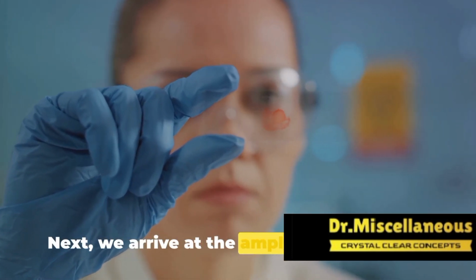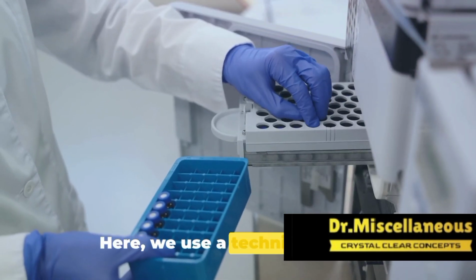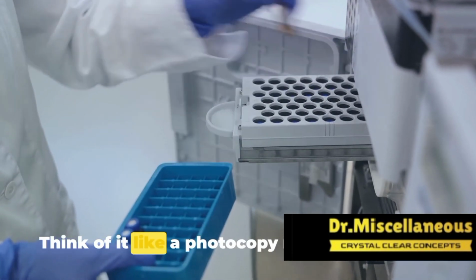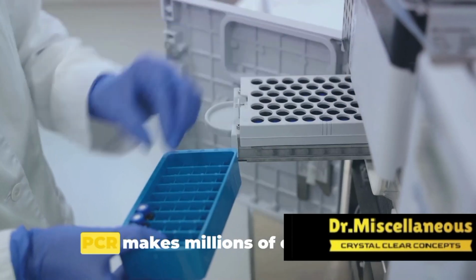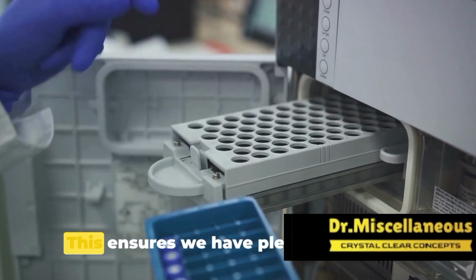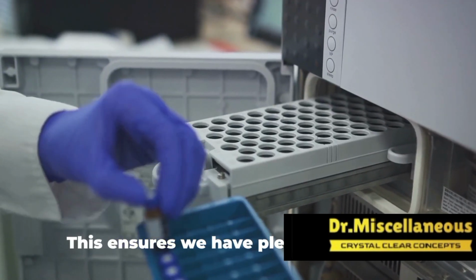Next, we arrive at the amplification station. Here we use a technique called polymerase chain reaction, or PCR for short. Think of it like a photocopy machine for DNA. PCR makes millions of copies of the specific DNA segment we're interested in. This ensures we have plenty of DNA for the next step.